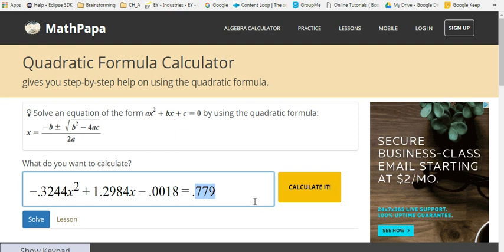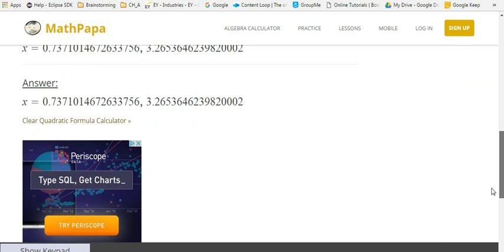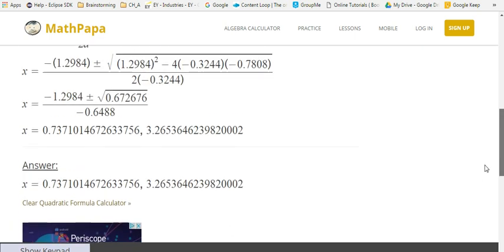putting in the absorption of the dilution that you have by putting in the Y value here. The absorbance is going to go as your Y and then you will just hit calculate and it will calculate it for you.